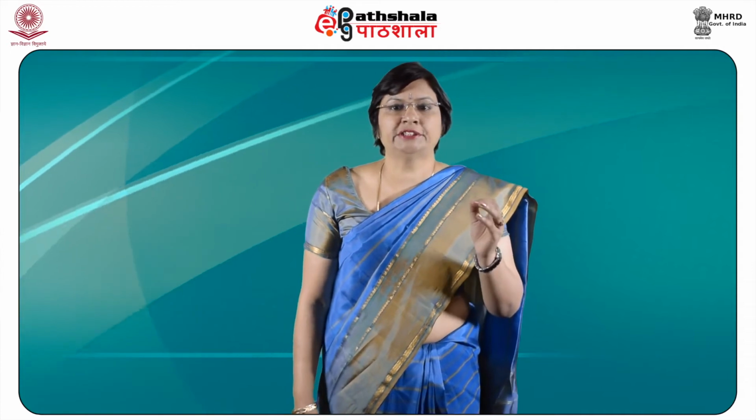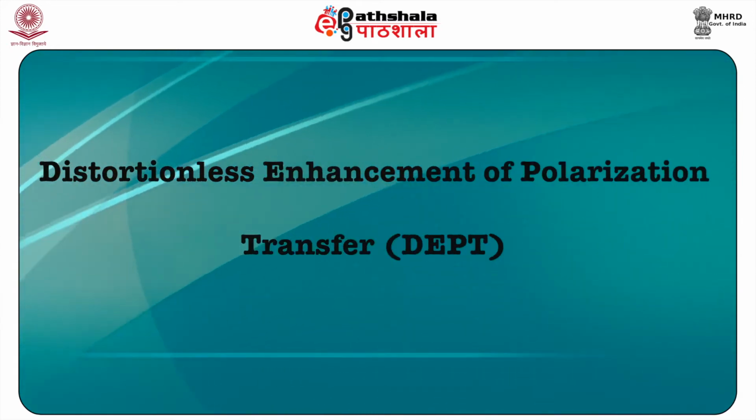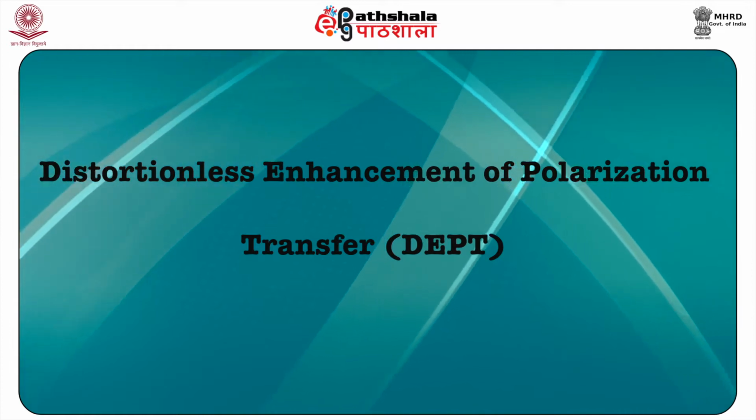2D NMR, that is two-dimensional NMR, is another advanced NMR technique. The 1H and 13C NMR spectrum is the all-time tool used by synthetic and biomolecular chemists to elucidate the structure of their products on a daily basis. The increasing complexity of natural compounds and their synthetic analogues implies the use of some more recent 2D NMR techniques that we shall be studying in this module. So, let us begin with knowing more details about DEPT, that is distortionless enhancement of polarization transfer.